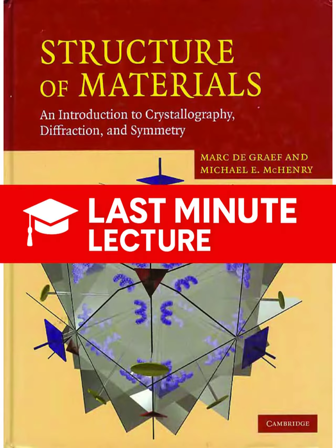And because those electronic energy levels are fixed and unique to the target material, be it copper, molybdenum, or iron, the resulting wavelengths are a characteristic fingerprint of that element. Which we call the Kα line for the L to K transition and Kβ for M to K. And we typically use the Kα line because it's the most intense. It's the strongest signal. It's amazing how a simple choice, like using a copper target versus a molybdenum target, completely changes the energy and wavelength of your tool. It changes the entire experiment.